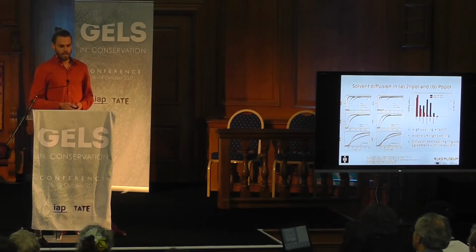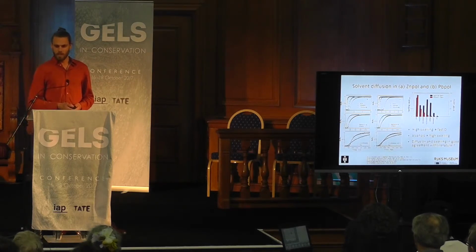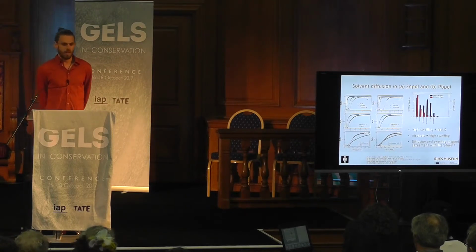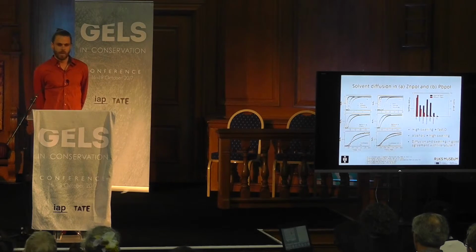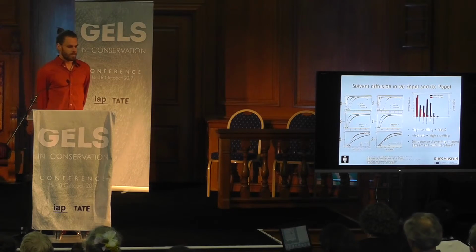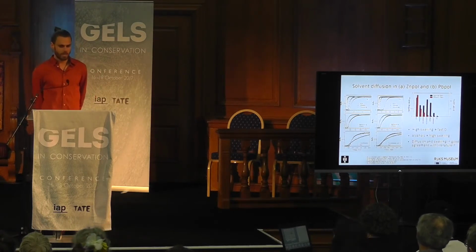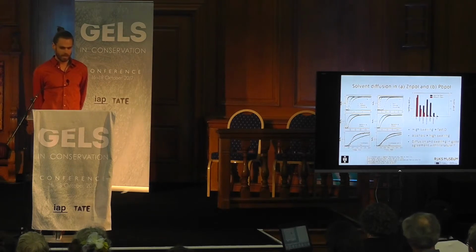And it's evident that generally high swelling solvents also have a fast diffusion. However, alcohols have a relatively high swelling compared to the diffusion. These results were also obtained by other researchers in the past with different techniques, and it's nice that they agree well with trends found in literature, because this means that we have developed a method that works well for measuring diffusion in paints.